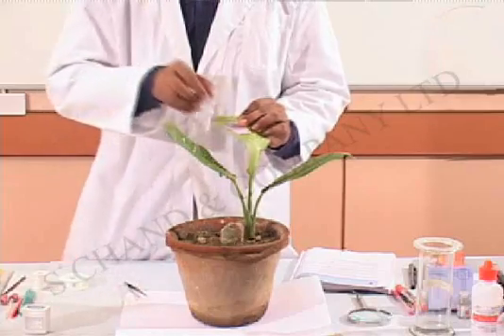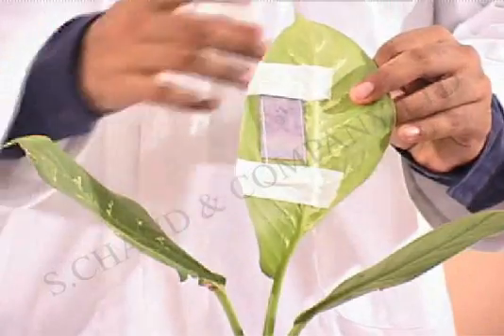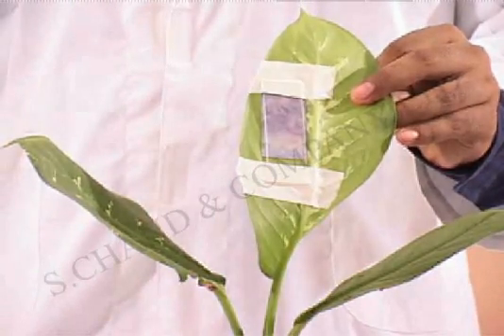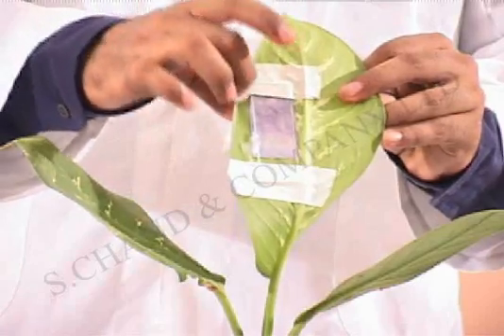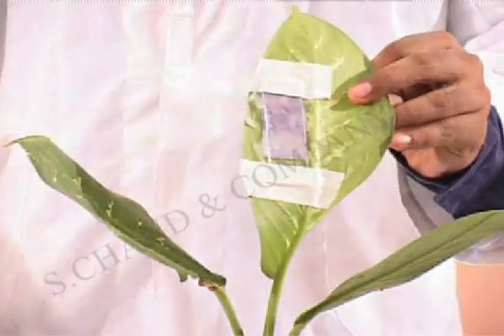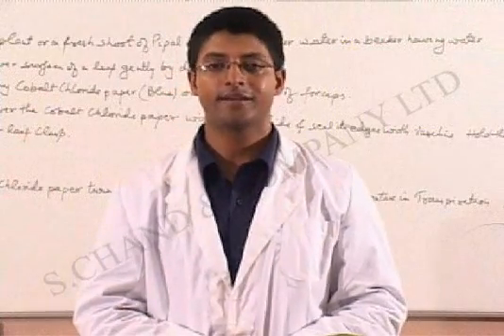And we quickly cover it up with a slide. The slide has been placed over the cobalt chloride paper, and now we'll be sealing the edges with vaseline. We'll now leave the plant as it is for a while and come back to it after some time.